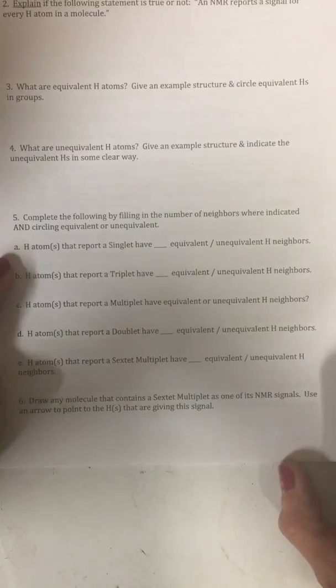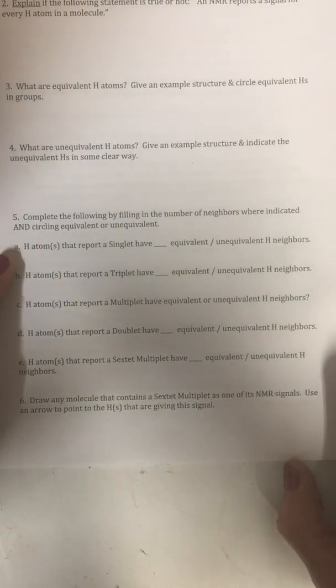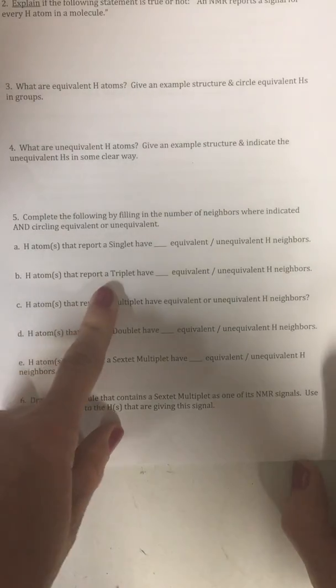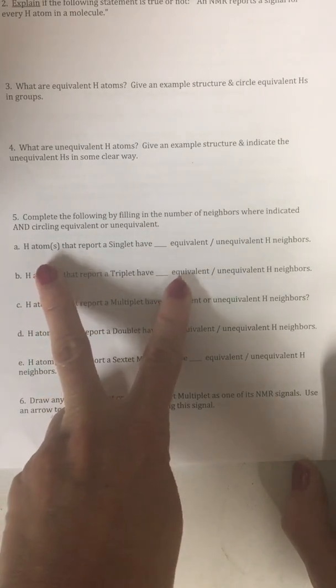Number A says hydrogen atoms that report a singlet. If you just saw a singlet, what does that mean? A singlet would mean you have 0 neighbors. Hydrogen atoms that have a singlet for their signal would have 0 equivalent neighbors, because 0 plus 1 would give you the number 1, which is a singlet. B, we already saw a triplet. So for a group of hydrogens, or maybe just 1 hydrogen, to have a triplet, you have to have 2 equivalent neighbors.